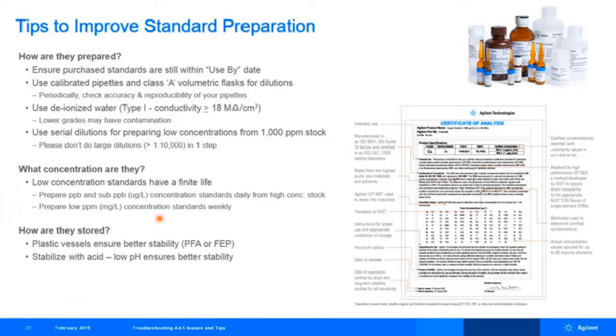Now, if you're working in the ppm range, then it's still recommended that you replace those standards frequently, but usually there it's on a weekly or a monthly basis, again depending on the concentration that you're working at.